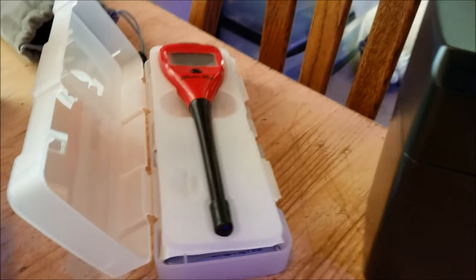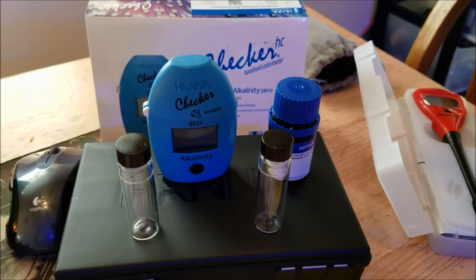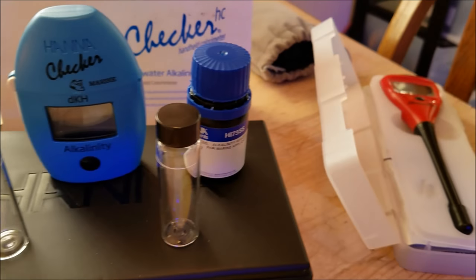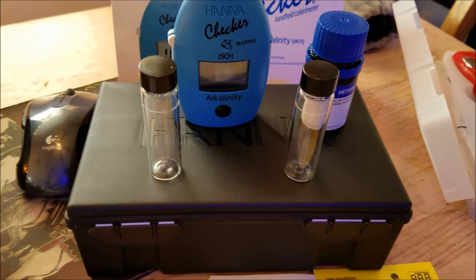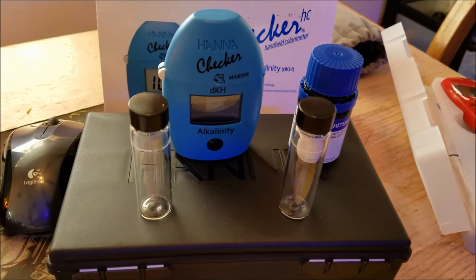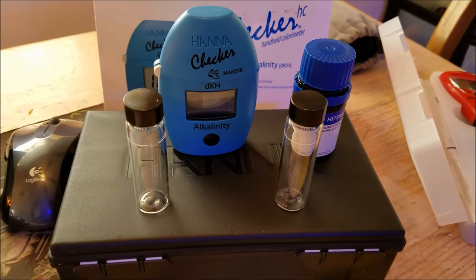The recent purchase has been the Hanna pH Checker and the Alkalinity Checker. I've used these in the past but never owned them, so I figured now is the time to make the commitment, go ahead and purchase them, and use them in a test. What we'll do today is go through the testing steps for each one and see what the results are.